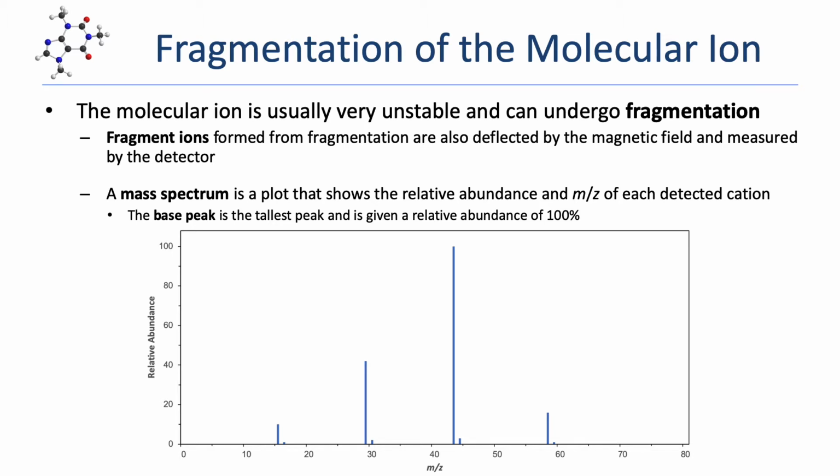Now, oftentimes, the major peaks will also have some much smaller satellite peaks. You can see that on the spectrum. And while some of those satellite peaks can occasionally be useful, we're going to just ignore them and stick to the major peaks in any given spectrum.